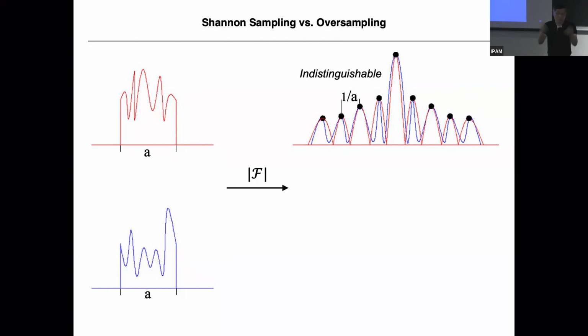Nowadays, people use hundreds of crystals to determine structures, because as the crystal gets smaller, it gets damaged after maybe a few angles. So you can use multiple crystals. People do that. And so the problem is how to solve the phase problem, right? Phase is an important problem.